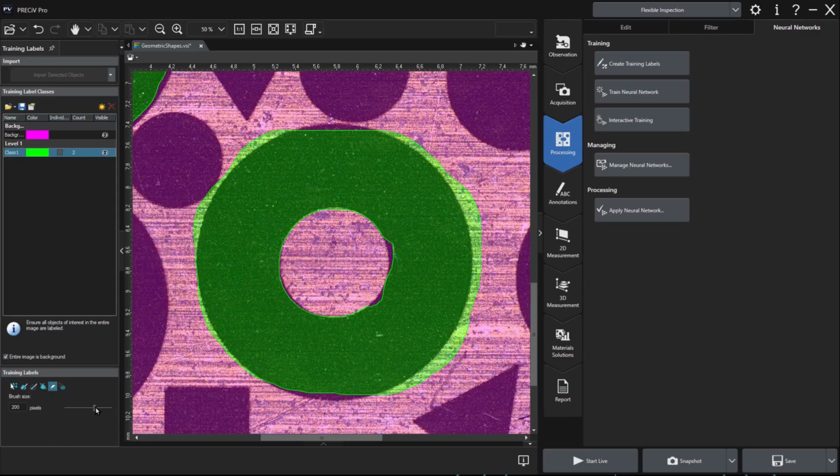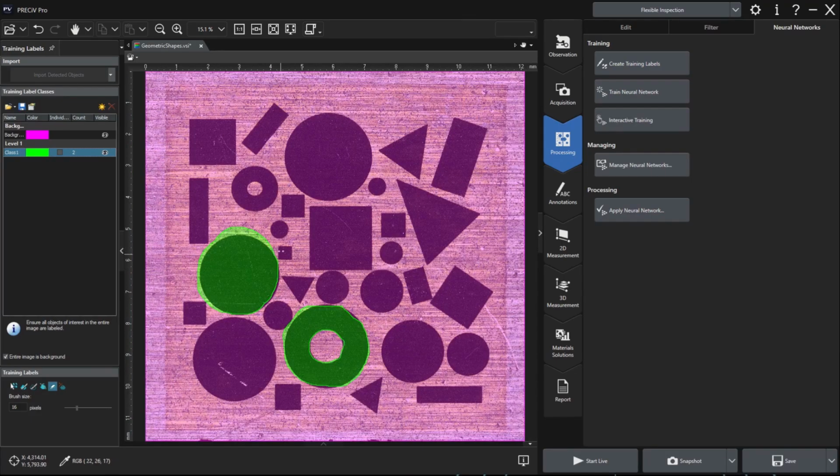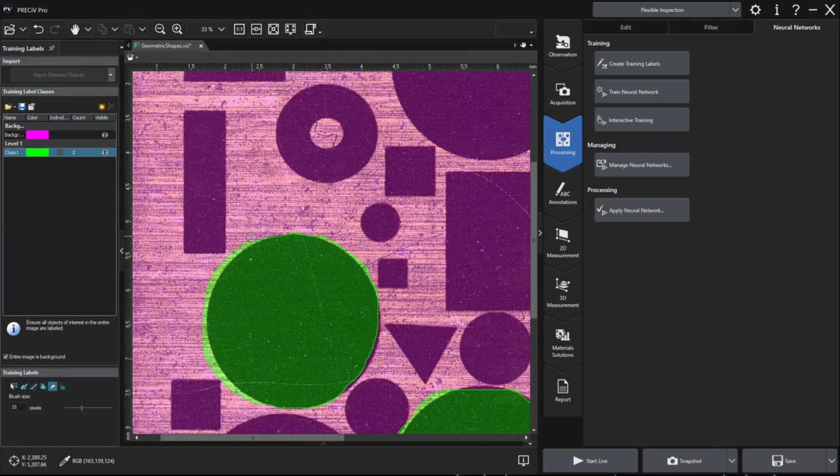But while I delete some wrong object labels, it's time for a remark. Instead of being extremely precise while labeling only a few objects, it's better to do it quick and dirty on more objects. Remember our entire image's background approach. The network sees all the transitions between objects and background, and your little inaccuracies will balance out statistically the more objects you label. A ballpark figure is 100 labeled objects per object class for a first training. This depends on the complexity of the task.